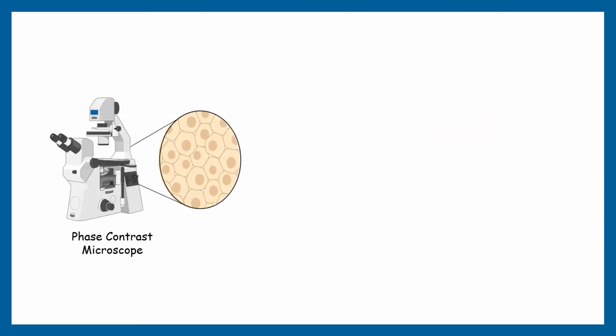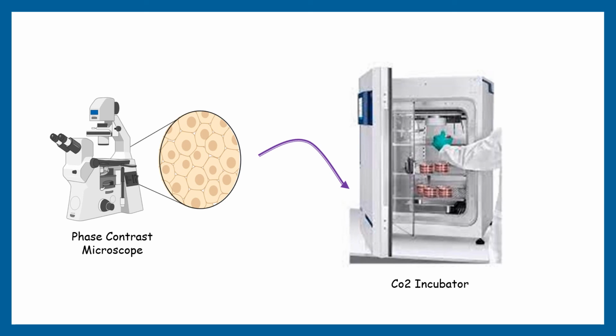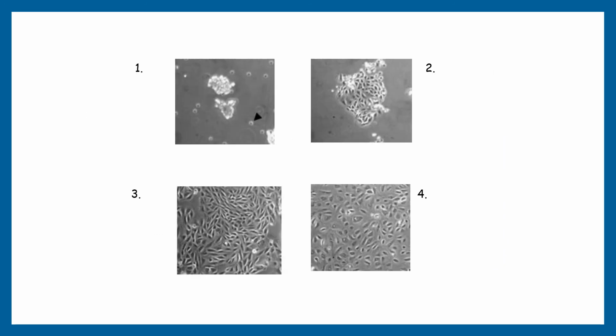Clusters of the ovarian surface epithelial cells can be visualized floating in the medium in each of the wells. Erythrocytes will likely be present but usually in very small amounts, and they will be removed with the first medium change. Then you just put it in a CO2 incubator for their growth. Leave the plate of cells in the incubator for at least 3 to 4 days prior to the first medium replacement.